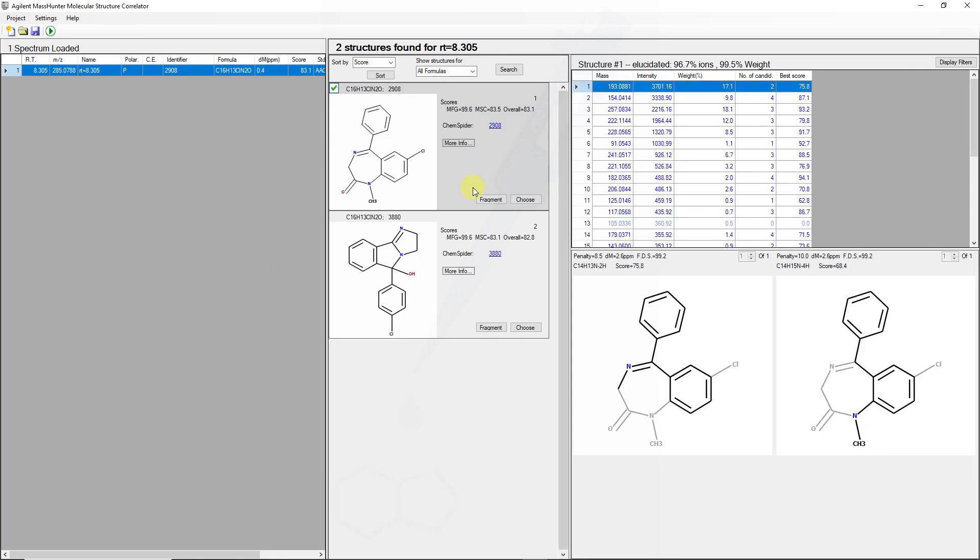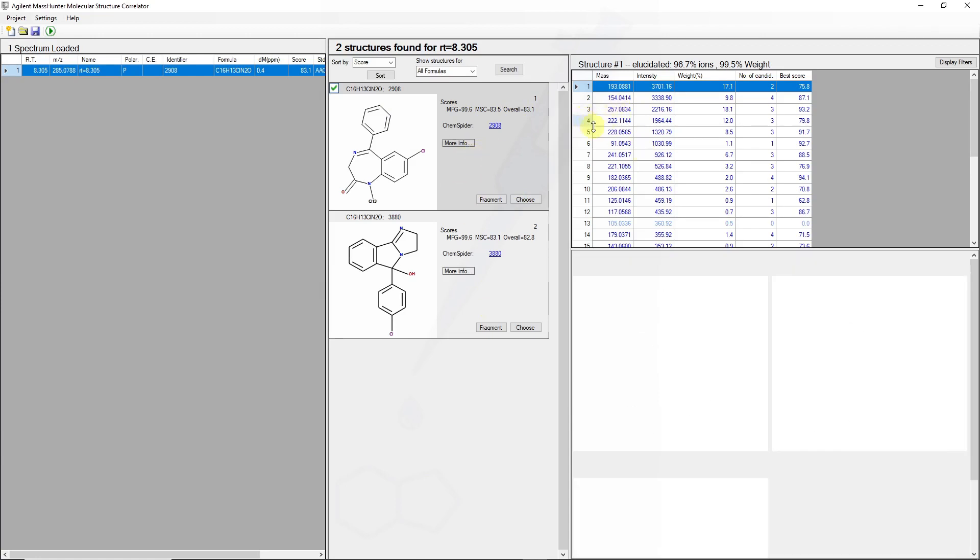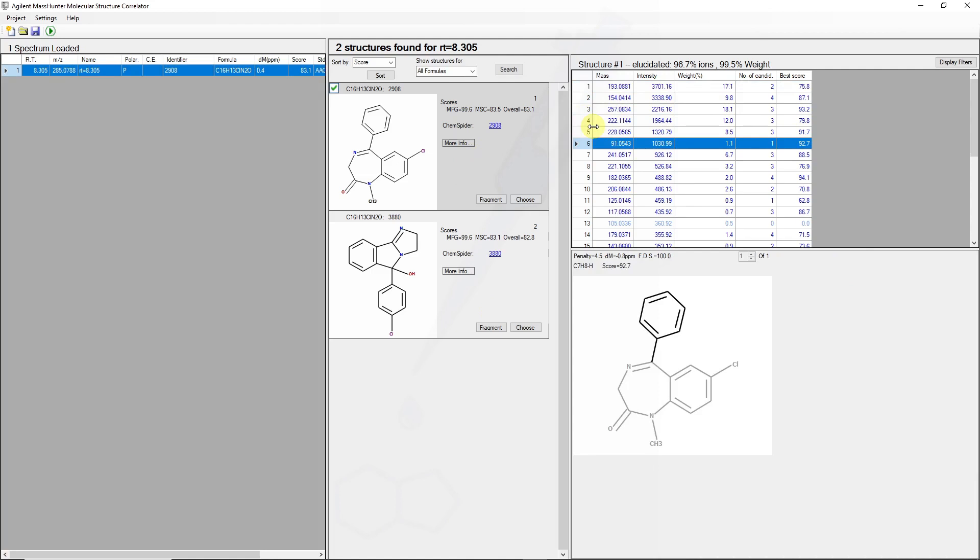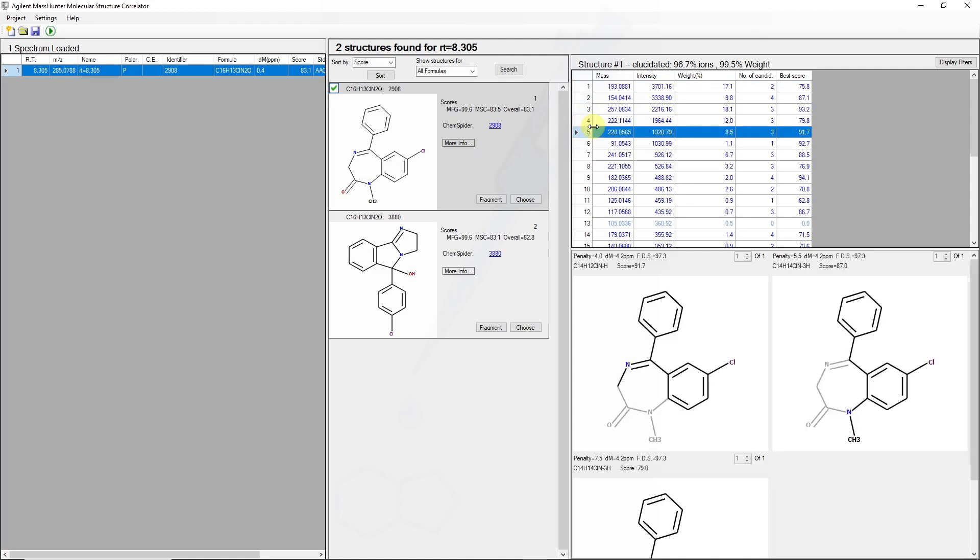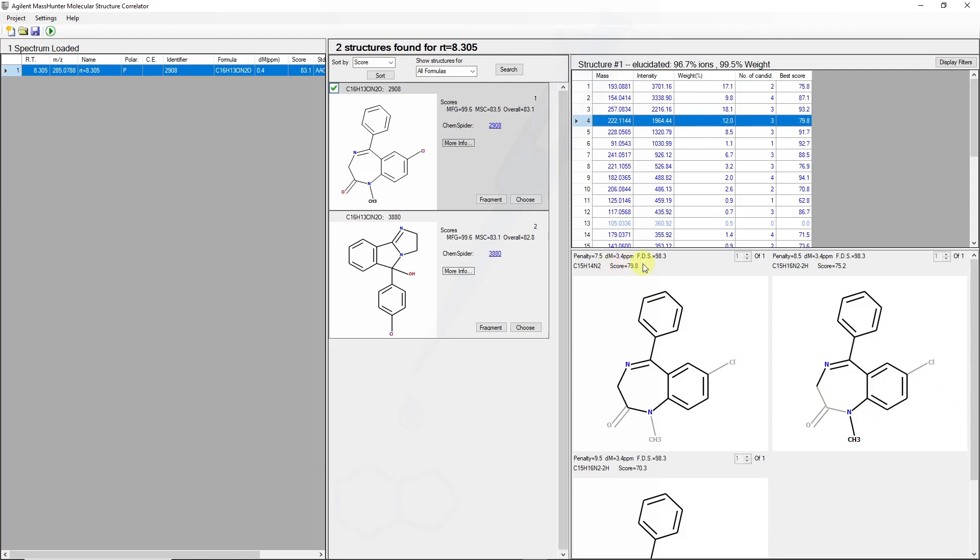So here you can see some of the results from ChemSpider, where diazepam was ranked higher than the Mazendol structure. And again, you can explore the different fragmentation pathways, and the likelihood whether these are formed is stipulated by the score given here.